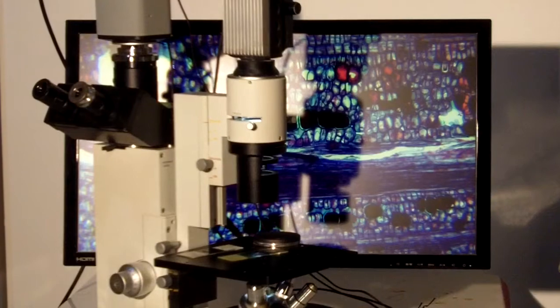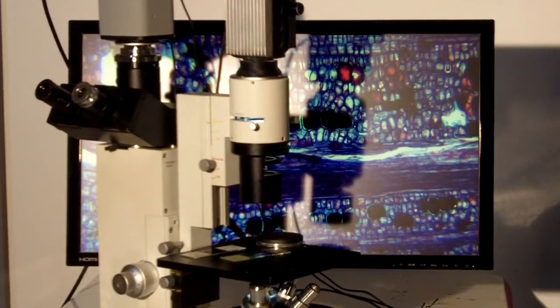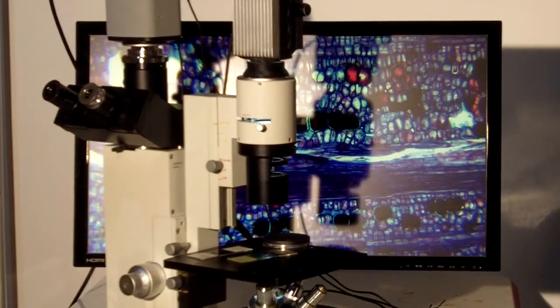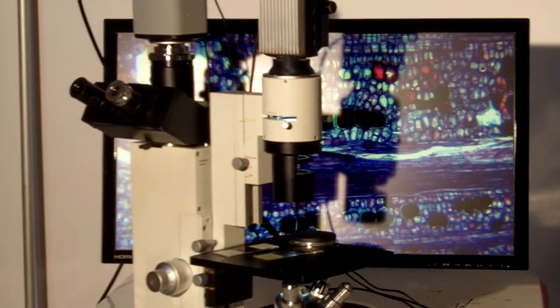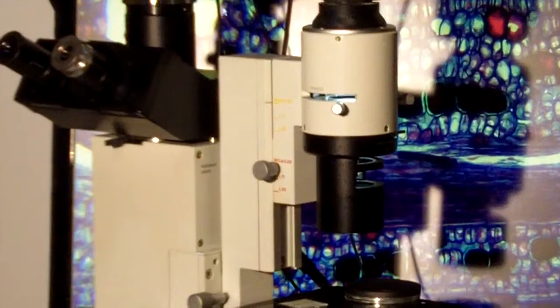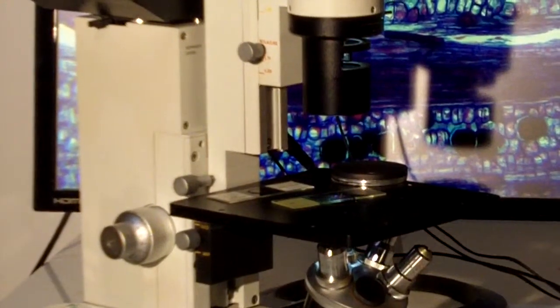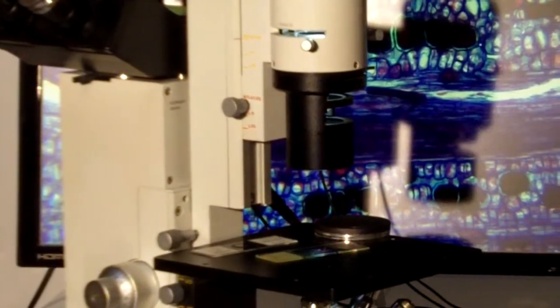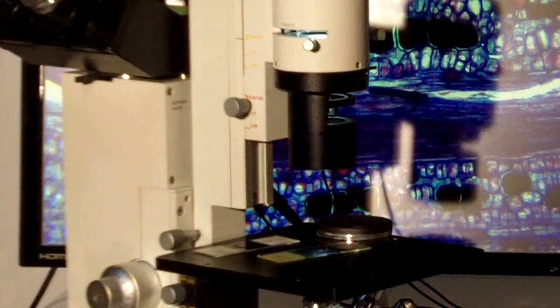Here's the Diavert set up and we're looking now at a flower cross-section, a typical teaching slide that you see here on the screen. I'm going to zoom in a bit and then we're going to talk about some of these accessories for the Diavert that make it even more useful for live cell studies.